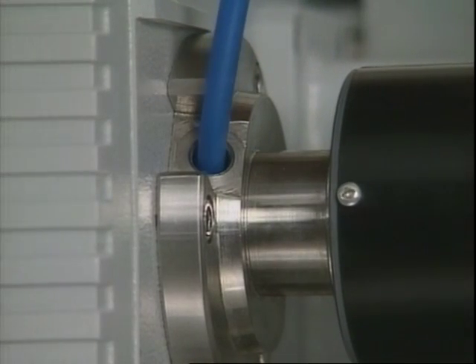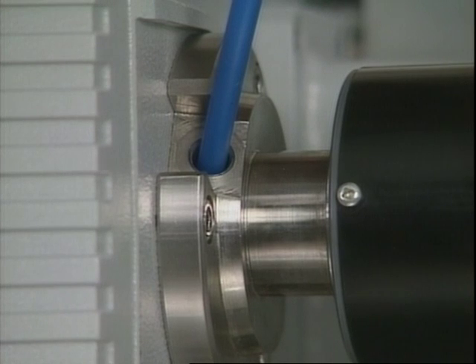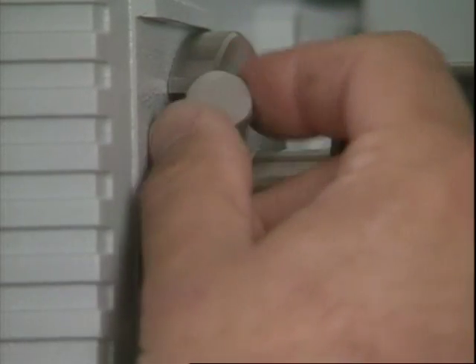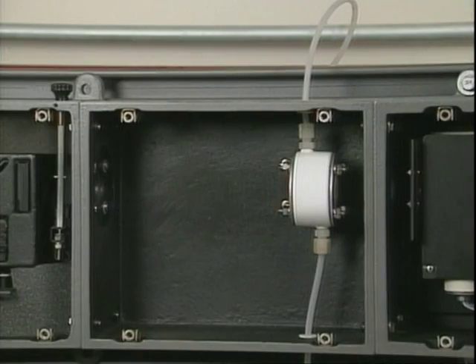After the cell has been mounted, flush the flanges with clean, dry nitrogen. Then, new absorbent scrubbers should be quickly screwed into place. Some analyzers may have an alignment procedure to correctly position the sample cell. Follow the manufacturer's instructions for your analyzer.